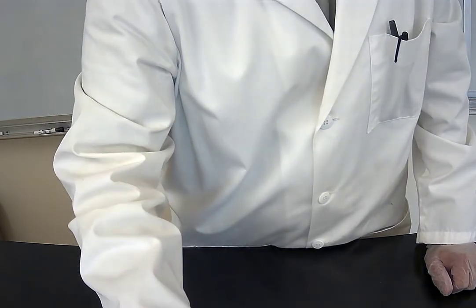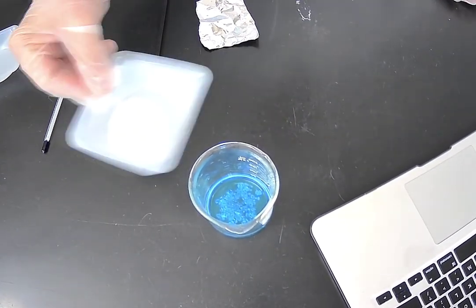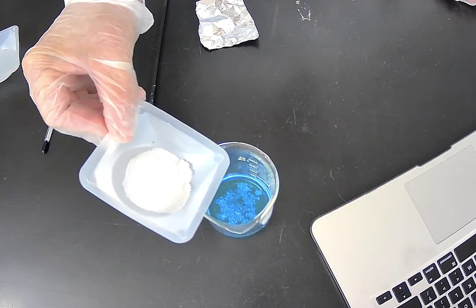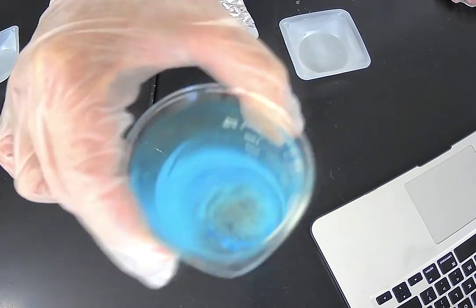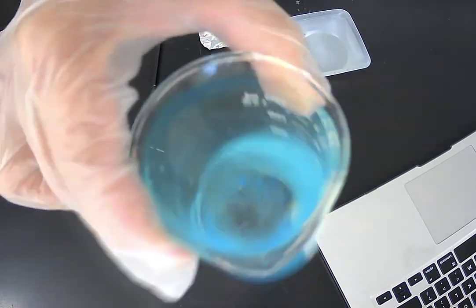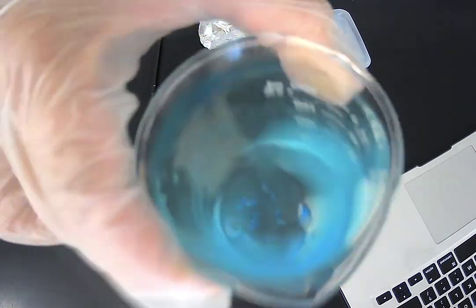Okay. Next, what we're going to do is take our sodium chloride, take that 3 grams, and add that to our copper sulfate solution. And once again, I'm going to swirl that around. All right, so now we have a solution of copper sulfate and sodium chloride dissolved in water.